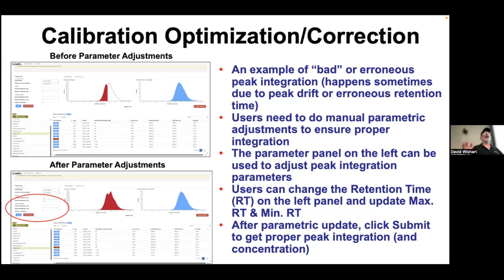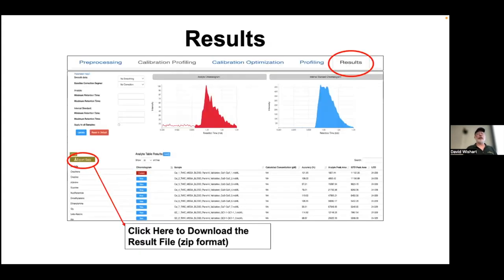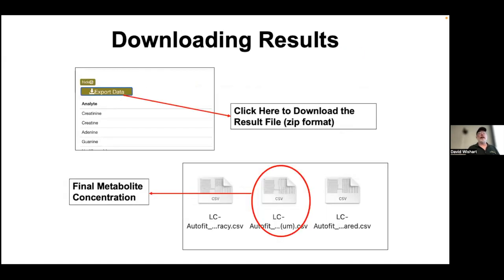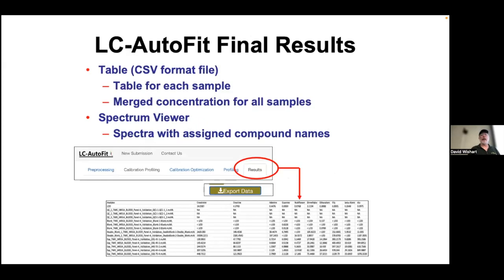These look at MRM pairs — the product ion, qualifier ion, parent ion, and retention times. To get the concentration you have to do the integration. Once you've finished any fixes, click on your results and download the results files in zip format. You'll find an LC file with your metabolite names and concentrations. LC AutoFit doesn't use J Spectral Viewer in the full way that GC AutoFit and NMR do, but the integration graphs use elements of J Spectral View.